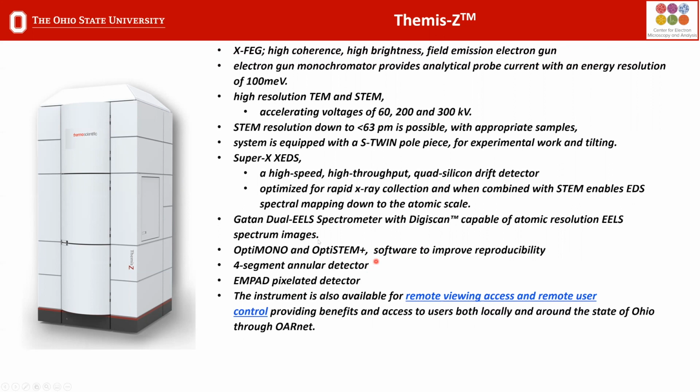And what we'll really talk about today are the two additional detectors that we have with this system, which is a 4-segment annular detector and an EMPAD pixelated detector.